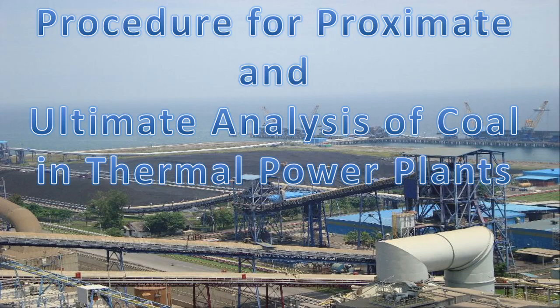Then the other thing is we may require it for some payments to the authorities from whom we are purchasing the coal. So for that purpose also it may be required. So in this session today we will discuss the procedures for proximate and ultimate analysis in thermal power plants.